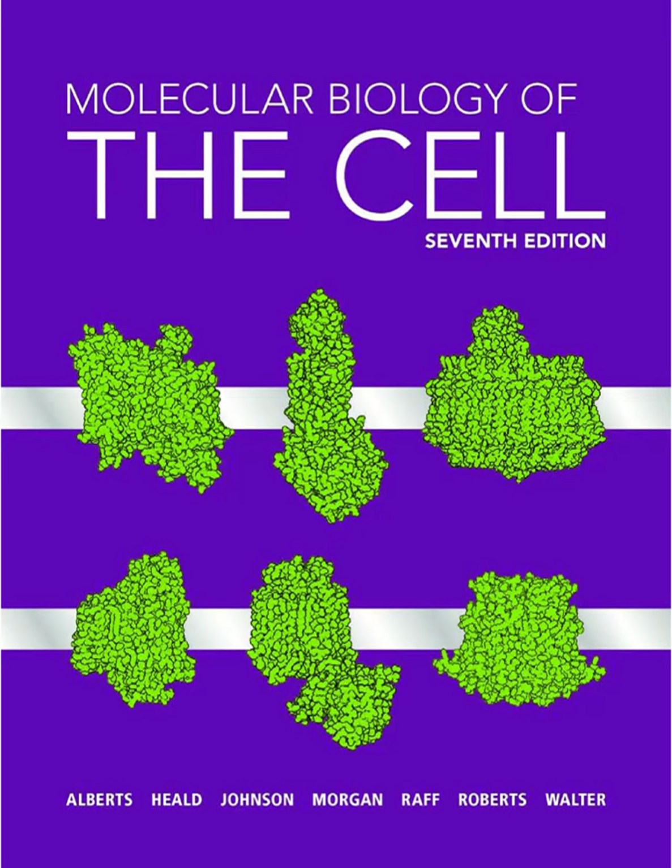And the other method? Negative staining. This is great for seeing the shape and subunit structure of isolated particles, like viruses or ribosomes. You mix your sample with heavy metal salt solution, like uranyl acetate, on the grid. The solution dries down, forming a dense electron scattering background everywhere except where the particle is sitting. So the particle excludes the stain. Right. The particle itself is unstained and appears bright, electron-lucent against a dark background of heavy metal, hence negative staining.